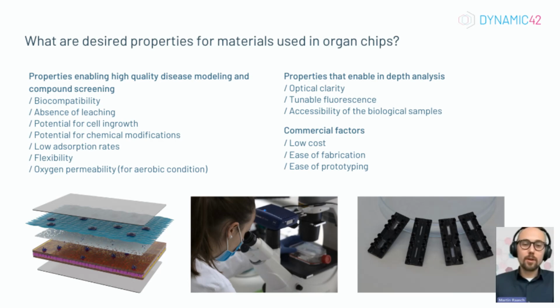And if you're looking more into scaling up your production because you have a large lab and a lot of people who want to work with it, or you even want to provide your platform to others, commercial factors come into place, like what the costs are to produce your devices.